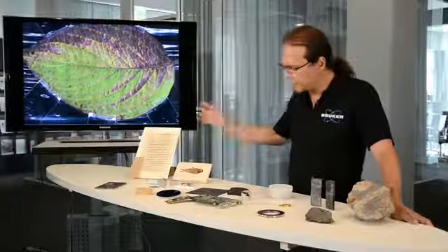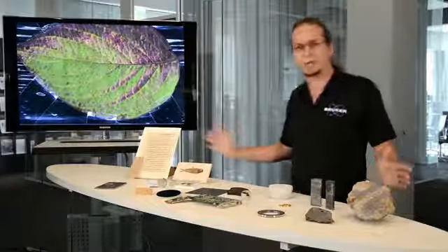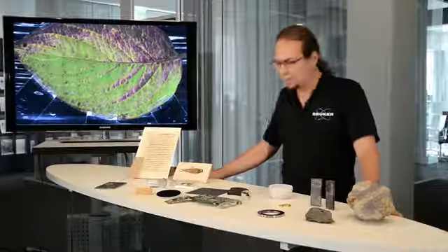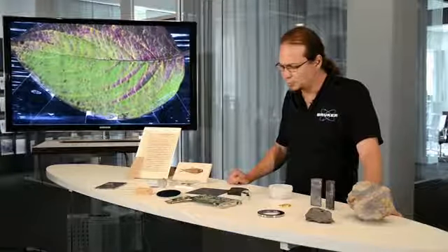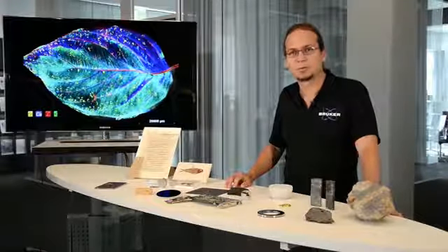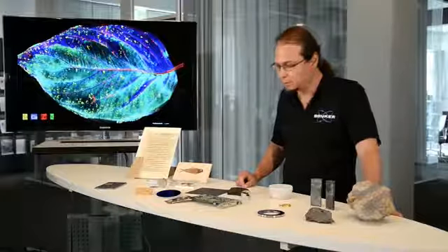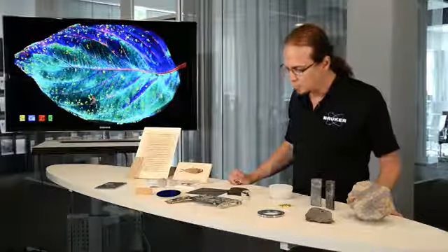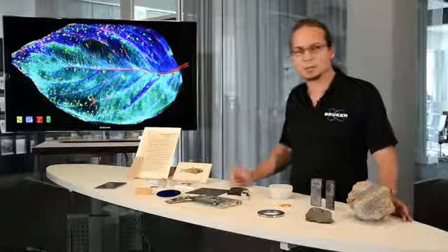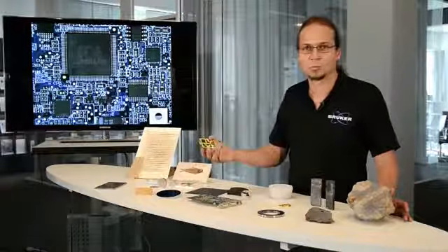On the table we have a variety of applications but just a small part of the samples we have measured over the last years. I hope I could give you a brief introduction or an idea that everything could be a sample that can be measured with X-ray fluorescence and especially with spatially resolved X-ray fluorescence. After the measurement you have on one side the data with the composition information of the sample and on the other side you have the sample as it was before.